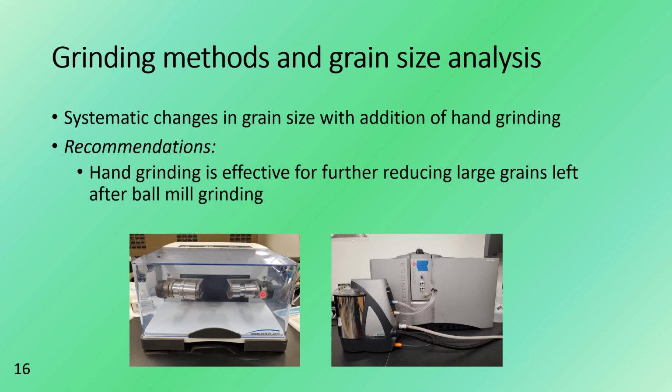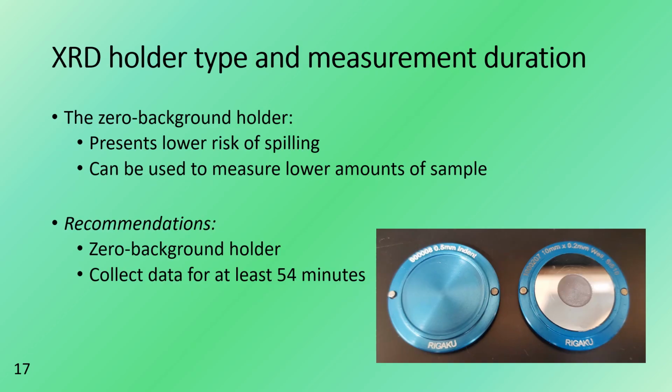So this image on the left is the ball mill. I used this particular container that I'm circling for sample grinding. And then this image on the right is the particle size analyzer that I used. So getting into XRD holder type and measurement duration.